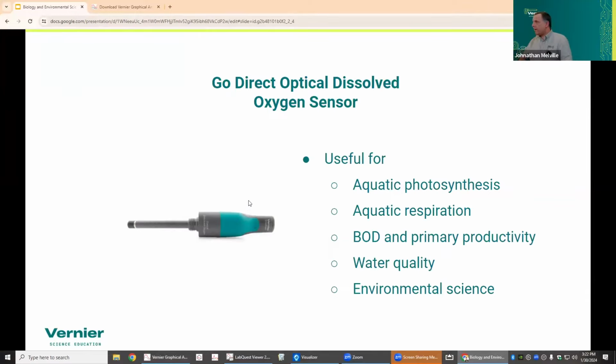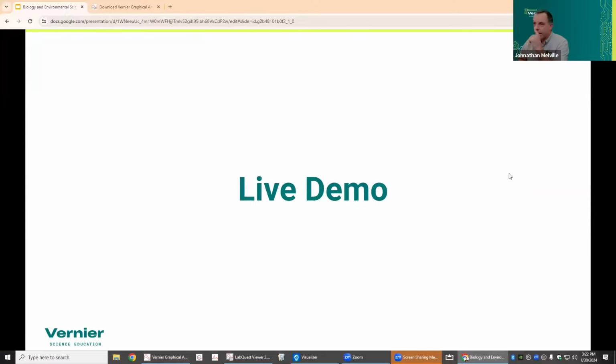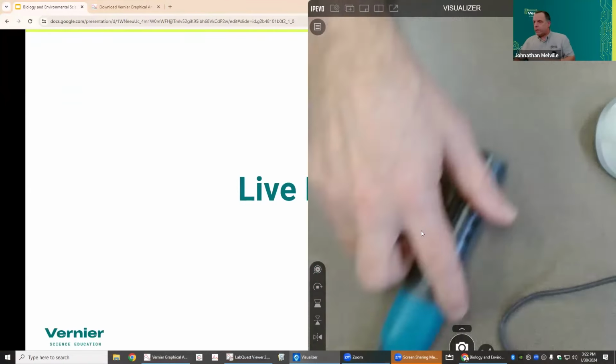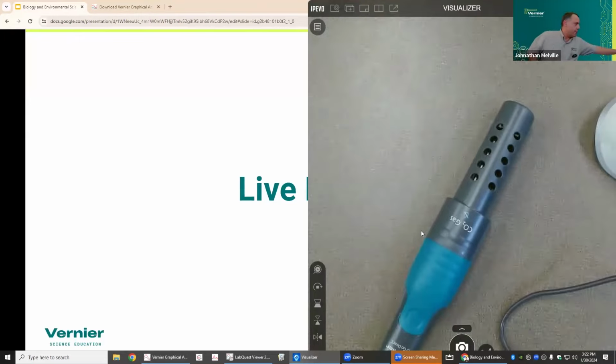All right, any questions about CO2? That's a great one. All right, so what about using yeast? Okay, let's go back to Visualizer. I'll show you how that works. What's great about the CO2 gas sensor is it's super sensitive.